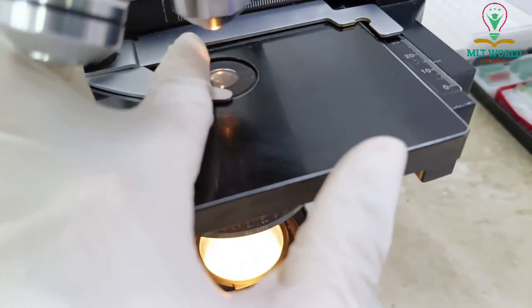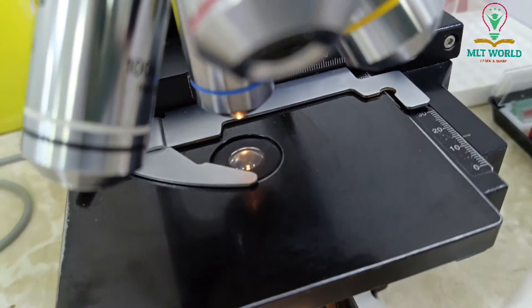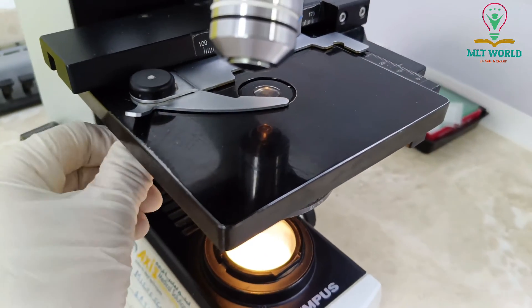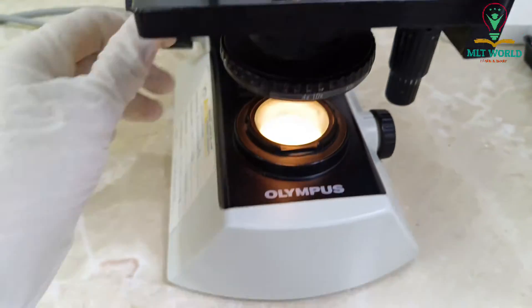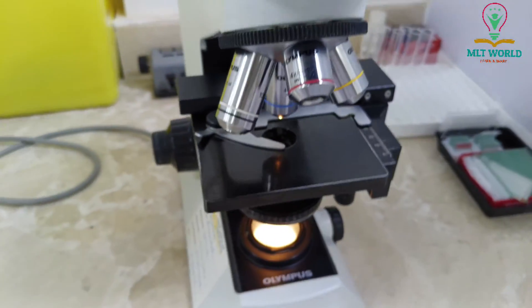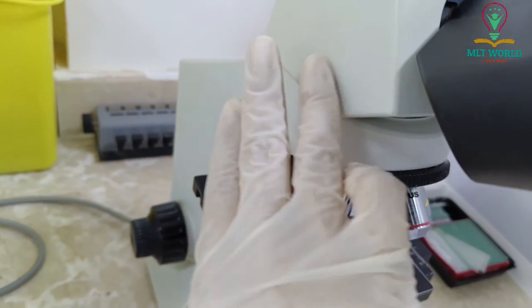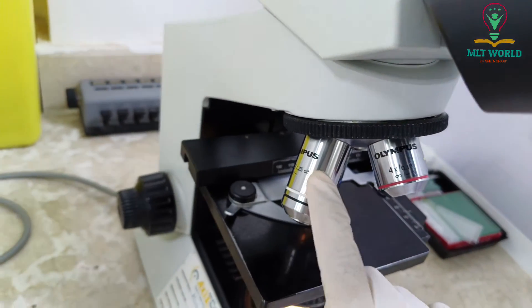This is the condenser, which we move up and down. If you are doing blood smears, you have to move the condenser up with the help of the diaphragm. But if you are doing urine and stool microscopy, you have to keep the condenser down.